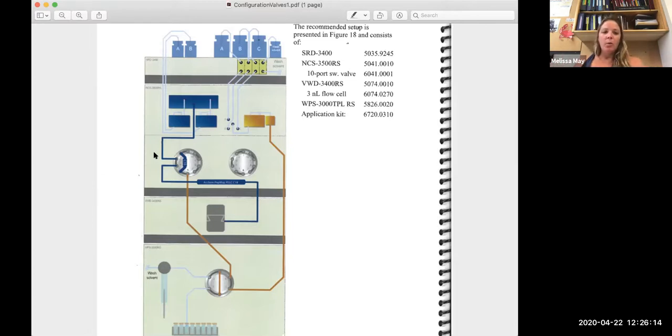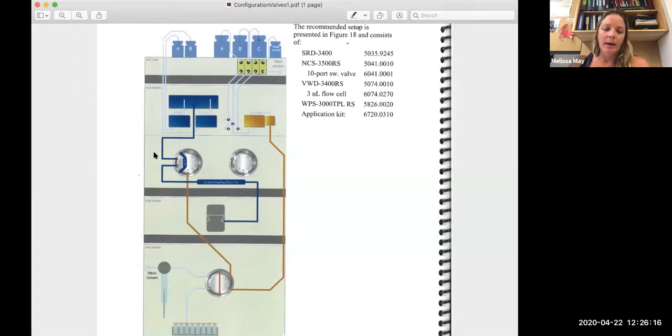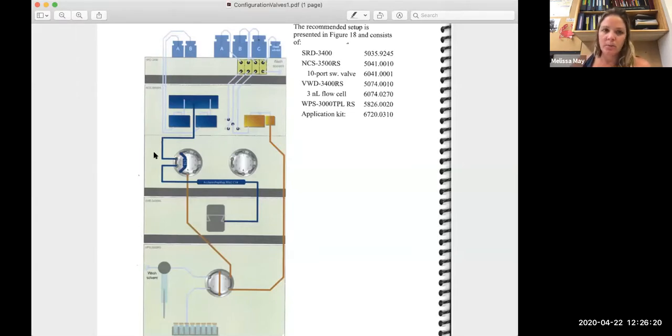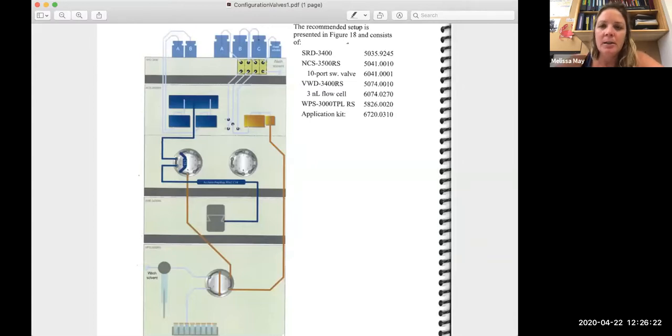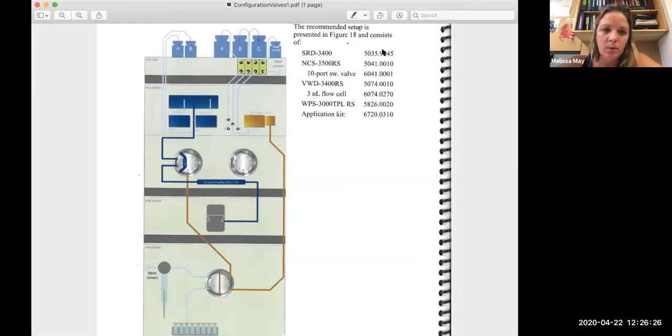And so when we are in the one-two position, which typically is what happens when we're loading our sample, our flow from the loading pump is going to go from our solvent bottles into our pump module.